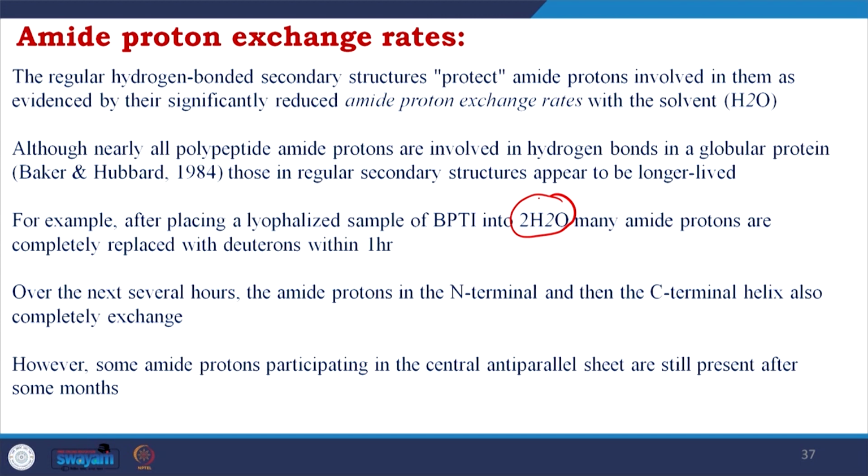So this is very interesting additional experimental information, telling you which hydrogens are held strongly. You keep making the experiments and you will see whether the replacement happens or not. If the replacement happened, they are relatively weaker. If they are still there, they are stronger.